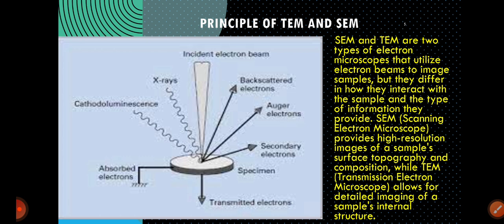When this beam is incident on a specimen, some amount of the incident electrons are absorbed by the specimen.